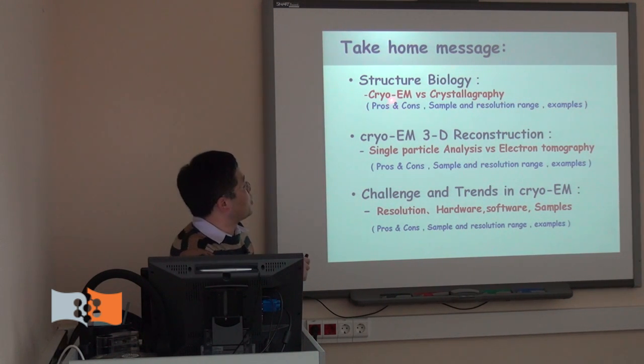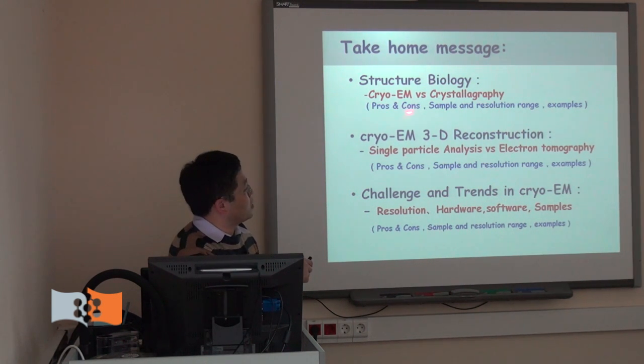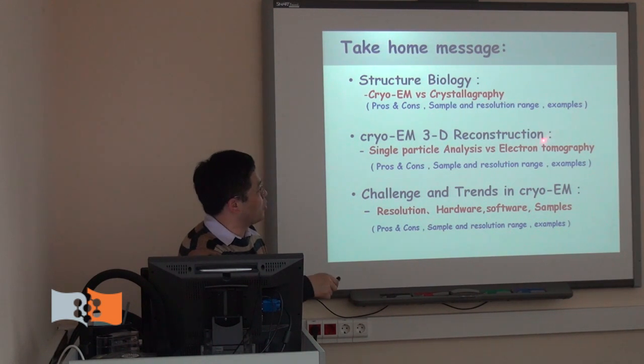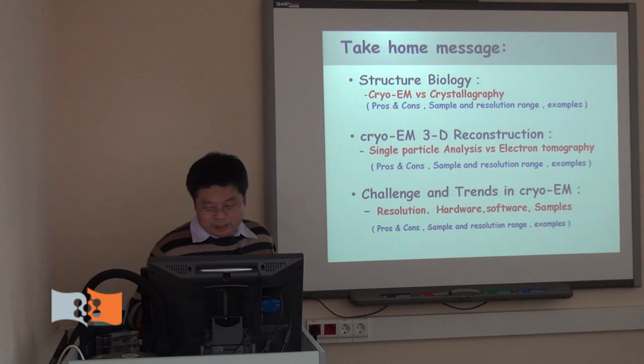I hope the students can understand structural biology: what are the advantages and disadvantages of cryo-EM versus crystallography, what are the principles of single particle and electron tomography, and how about the resolution as a development.